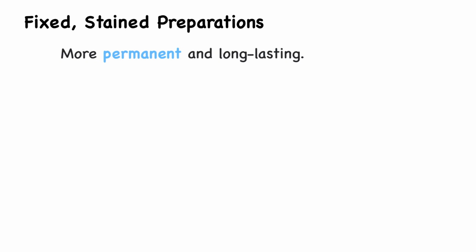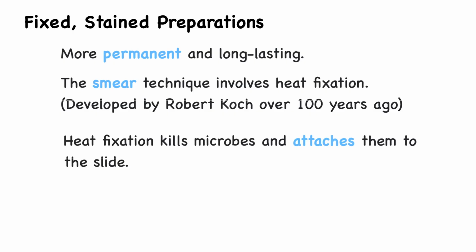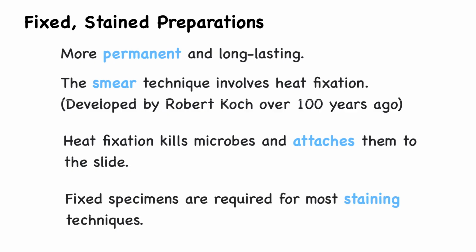or long-term study. This smear technique that was first developed by Robert Koch involves spreading a thin film of liquid sample onto a slide, letting it air dry, and then gently heat fixing it over a flame. Heat fixation is going to kill the microbes and firmly attach them to the glass. Heat fixation is required for nearly all staining techniques. After staining, these cells show clearer structural detail and have a longer shelf life.